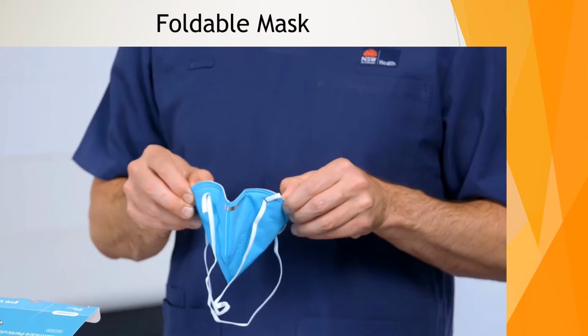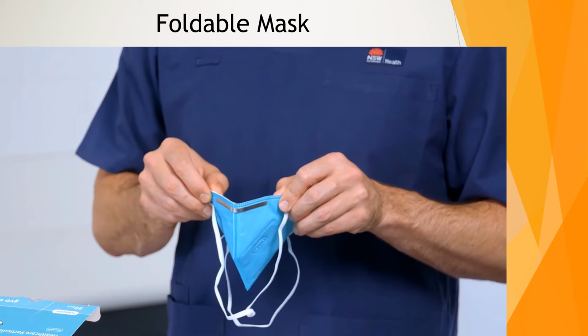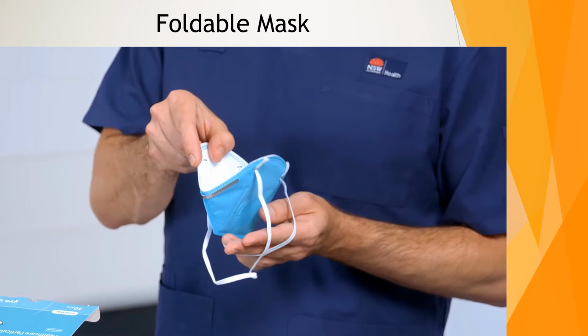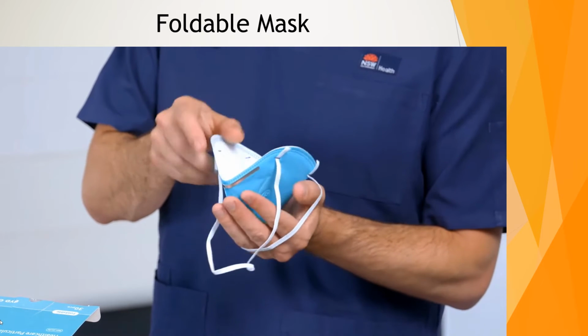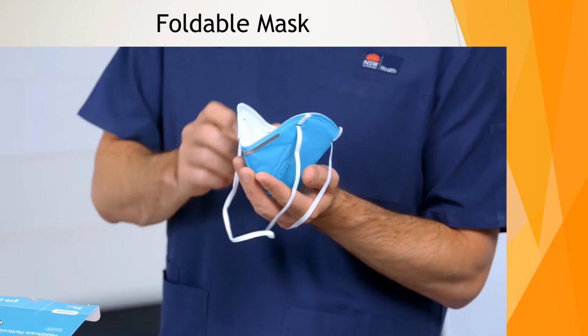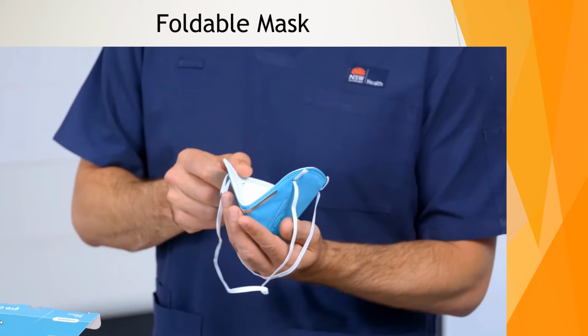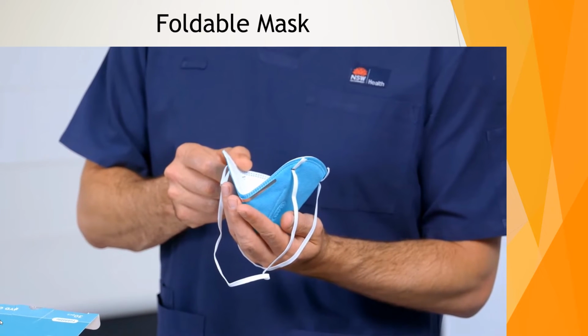Unfold the respirator and hold it with both hands with the metallic strip facing up. Fully open both panels of the respirator to form a cup shape with straps hanging below the hand. Cup the respirator in one hand with fingertips positioned at nose piece.